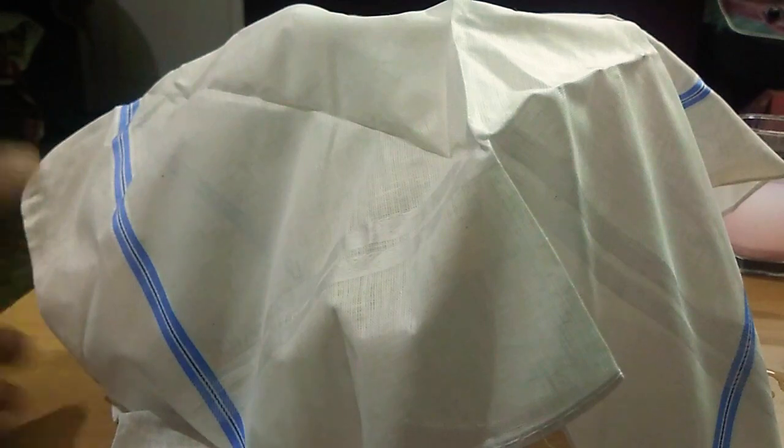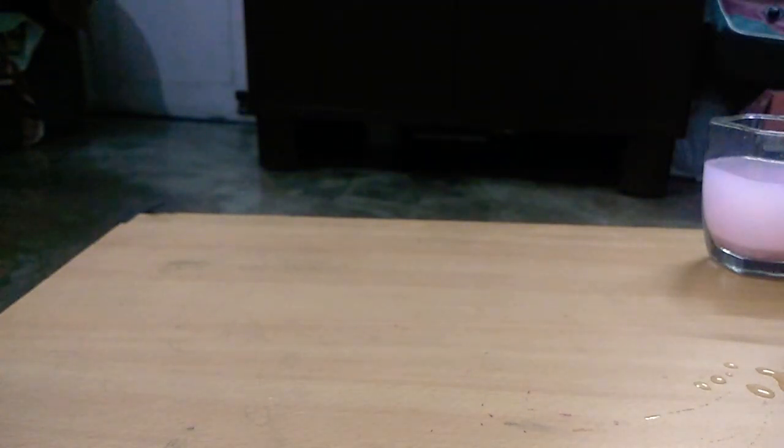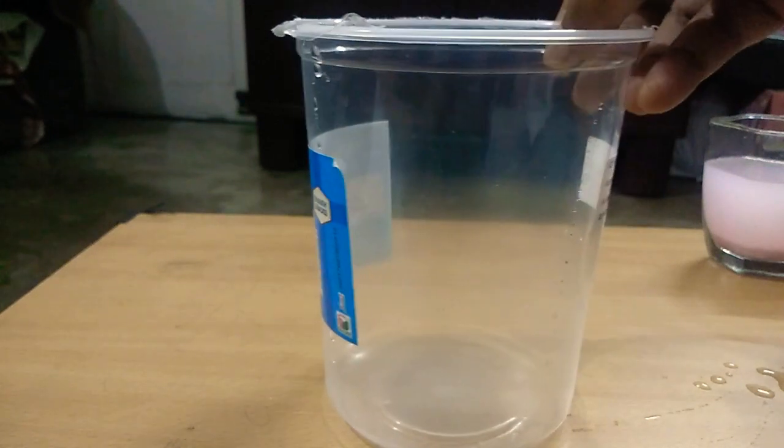As I pour it, if you see the cloth, there is no particle stuck and the entire solution has come out. So the particles of the solution are too small to be separated by filtration. You cannot separate them by the process of filtration.